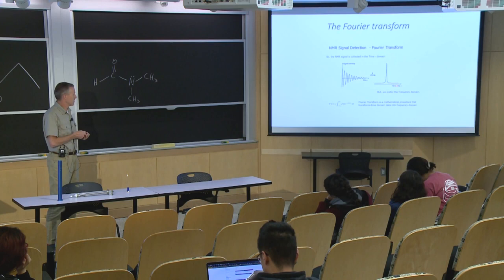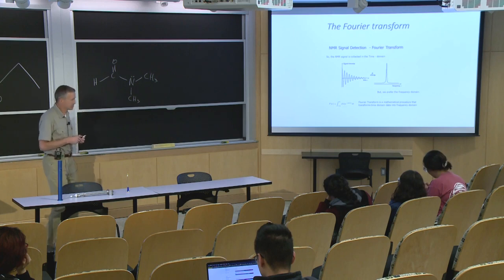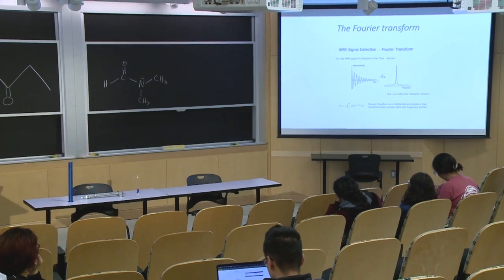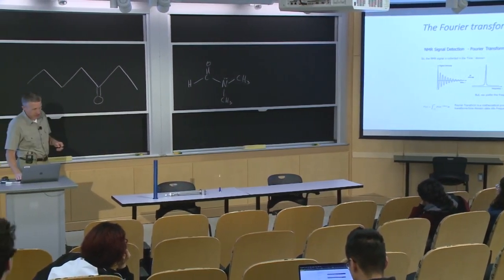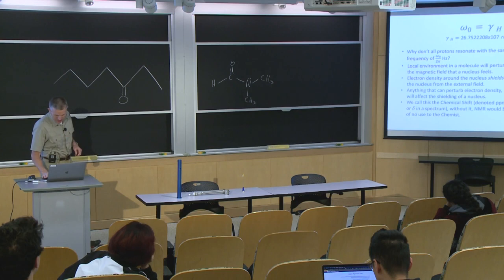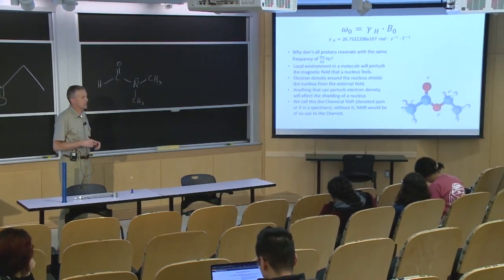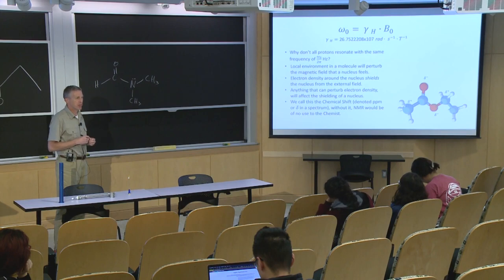That gives us our spectrum, which consists of lines, which we can look at and interpret and figure out. And no, I couldn't do a Fourier transform or solve one in my head or even on paper. So it's just something the computer does. So let's back up. I've given away a lot of this because I've already shown you several spectra, and you see that there are multiple lines.